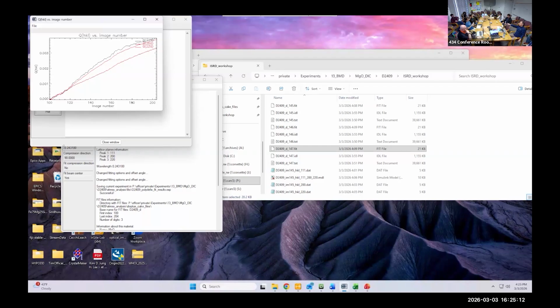Right. So I think the real bottom line at this point is, we can resolve some relative changes in the stress and strain curves. The absolute values may be floating somewhat. But I think the change relatively, you go from 1% strain to 5% strain, you change the stress by a certain increment. That you can really talk about. The really precise, can you say my MPa stress? We're not there yet.